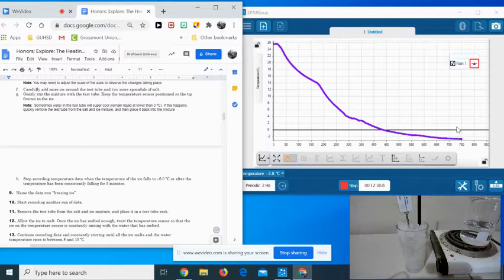Okay. So we're still at that -2.8, 2.7, 2.8. We've really just stayed there for a little while.